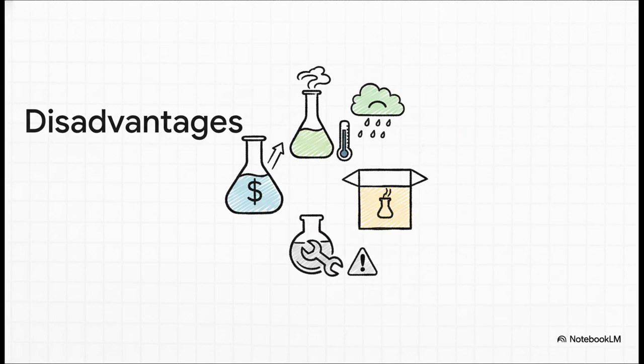And yeah, the problems don't stop there. For one, these special solvents can be really expensive and they evaporate easily, which isn't great for the environment. On top of that, you have to be super careful in the lab. You need to control the temperature perfectly and even keep the CO2 from the air from getting into your reaction. It's a lot to manage.